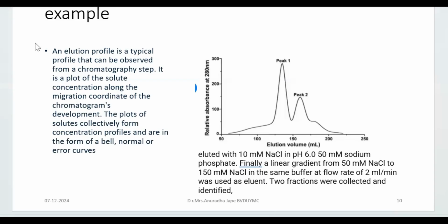So your system is attached to, say, a spectroscopic method. As the analyte is there in the fraction, spectroscopic analysis will be done and it will tell you this is the absorption at this particular nanometer at this particular time interval. Right. So the data will come up as a table and can also come up in the form of a graph.